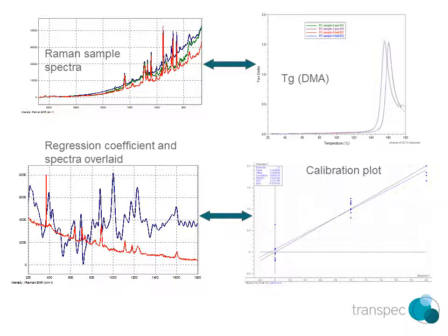In the plots above we can see the Raman spectra compared to the glass transitions, where there was a noticeable shift between good and bad samples. This was due to the physical aging. The glass transition values were then regressed to the spectra, and a model was built to predict both the glass transition and then the condition.